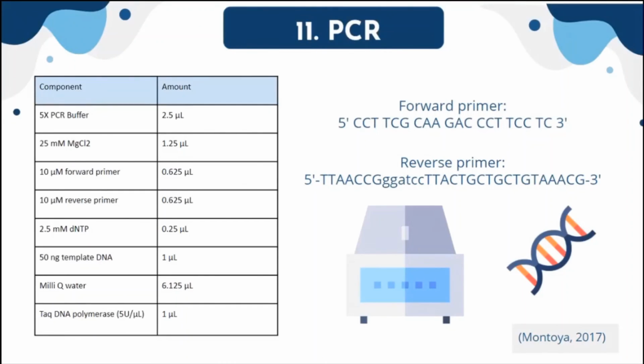First, we extract and isolate the genomic DNA of the transformed Chlorella with the use of CTAB and beta-mercaptoethanol at 2%. Then, we perform a regular PCR by using the following primers. This should help us determine if the gene of interest was correctly transferred.